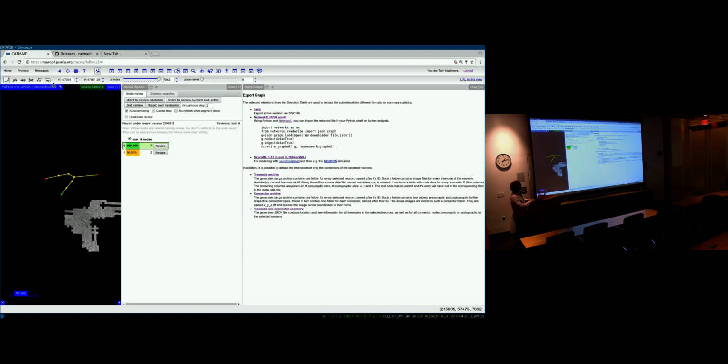Also, the disk icon, which was up here before, which was used to export SWC files, which is essentially a CSV file for a skeleton, has been removed or moved over here into the export widget. So you would now here export the SWC or not. Well, why ever it's not working right now. But anyhow, that's the idea. I got to look into that.